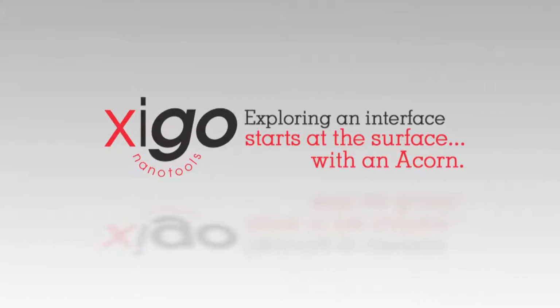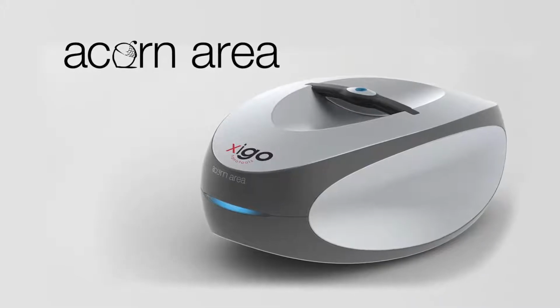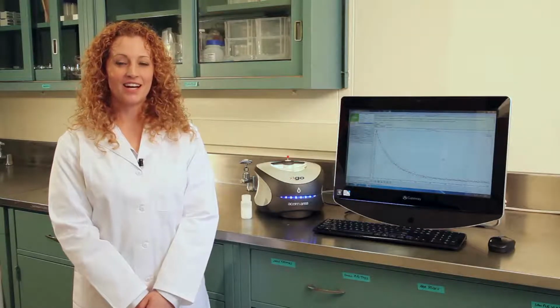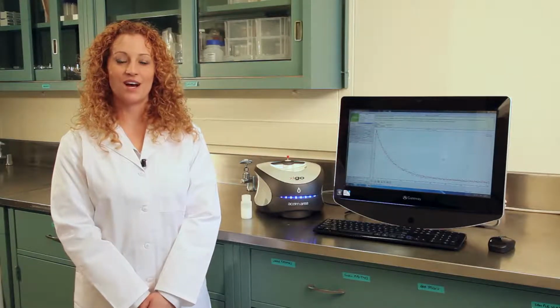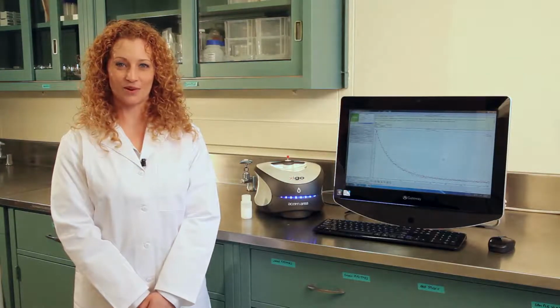Making surface area measurements used to be a time-consuming and laborious process. But now, using the revolutionary Acorn area, these measurements can be done in as little as 5 minutes. Today, I'm going to show you just how simple it can be to make a surface area measurement of a sample using our Acorn area and Area Quant software program.